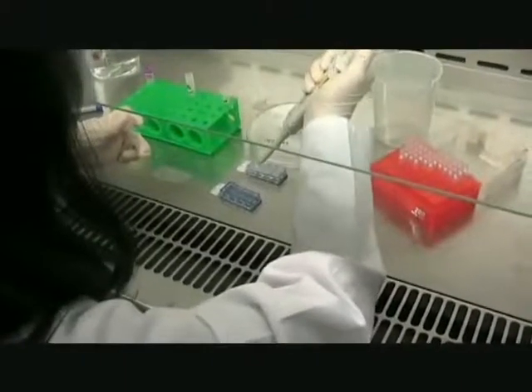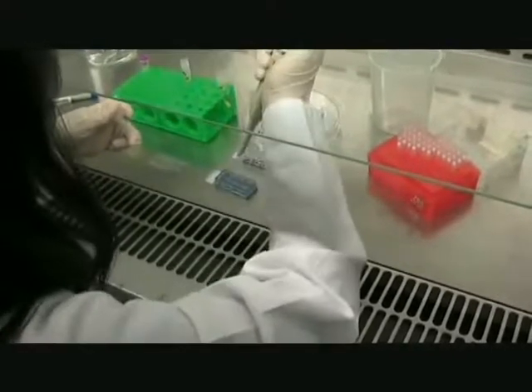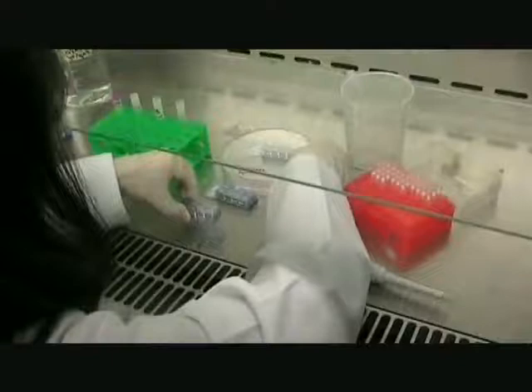Now let's start the experiment. The cells used in this experiment are human keratinocytes, which are prepared in chamber slides with 10,000 cells seeded in each well. Slides are incubated at 37 degrees in 5% carbon dioxide for 3 days prior to irradiation.